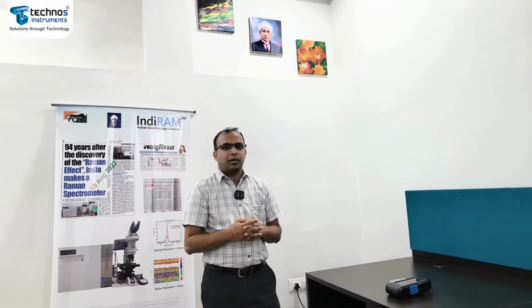So today we will see how IndiRAM Raman spectrometer can be used for pharmaceutical raw material identification application. So use of good quality raw material is of utmost importance in pharmaceutical manufacturing process as it provides improved drug efficacy and reduced risk of contamination.